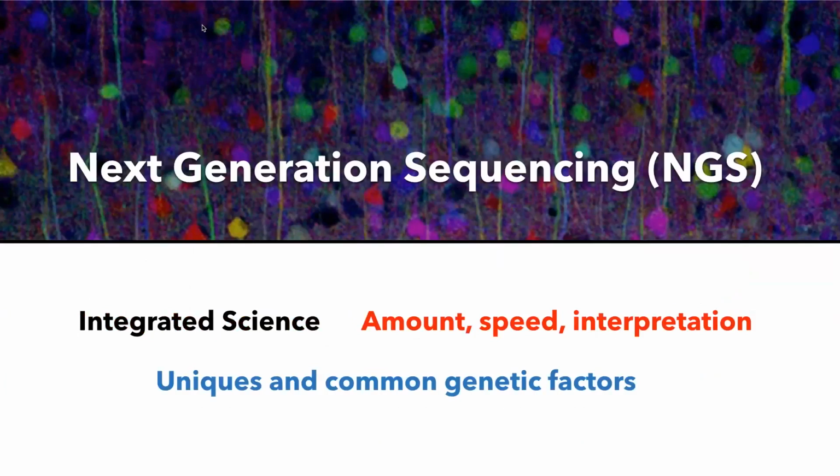It really is applicable to many different areas. And one of the main reasons for that is as it has developed, it not only generates lots of information and can do so very quickly, but we are now able to take all that information and interpret it and analyze it. So in the beginning, we were generating lots and lots of sequences, but that doesn't do a whole lot of good if you can't make sense of it.